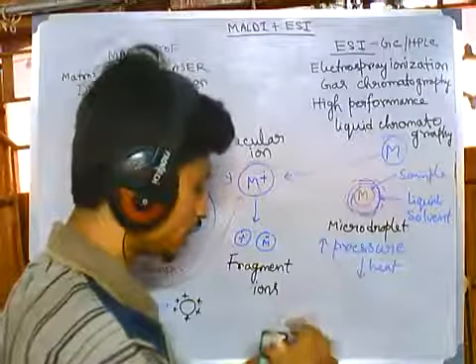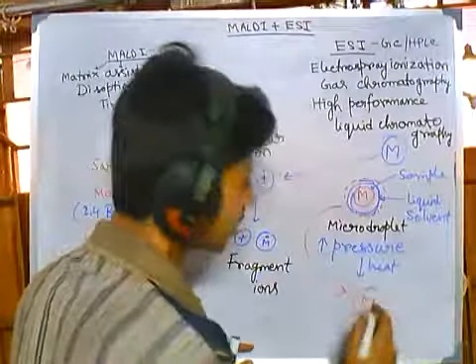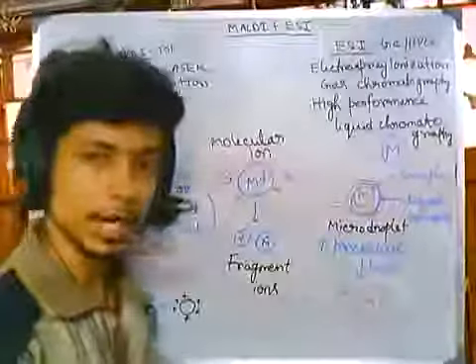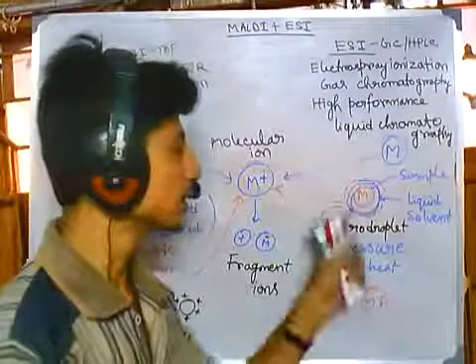It will lead to the generation of only molecules, and as they get heat, they will produce the molecular ion. So that's how it can generate the molecular ion. Okay, so constant heating due to the pressurization is going on here.